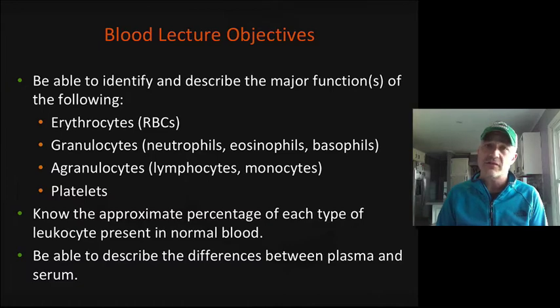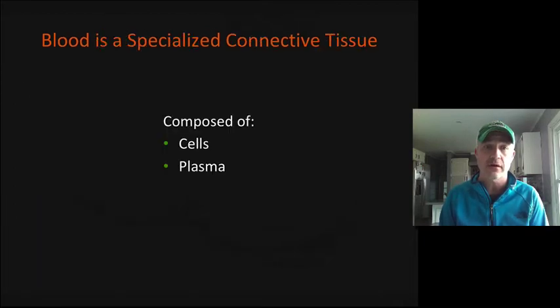On these things, I'm going to want you to have a basic idea of what they look like, be able to identify them, definitely understand the basic percentages of those normal leukocytes, and again, know a little bit more about just the overall composition of blood. Like I said, I will also tape a little bit with the digitized slides to put on the end of this show to actually show you some of these in an actual micrograph as well.